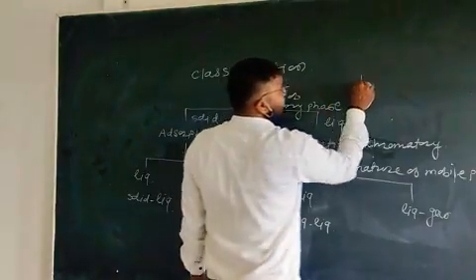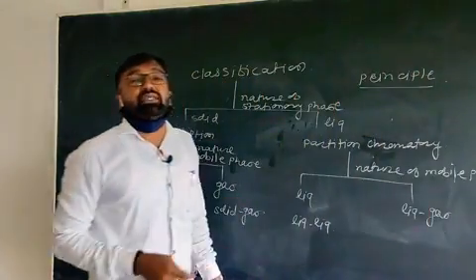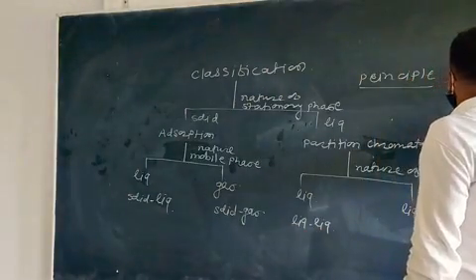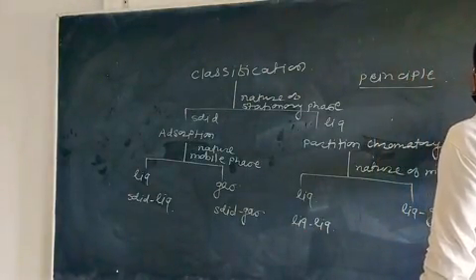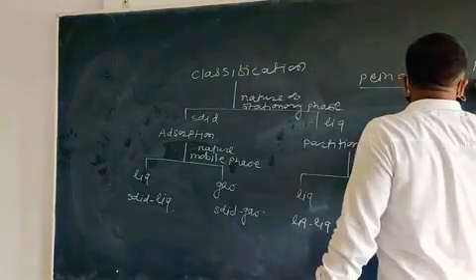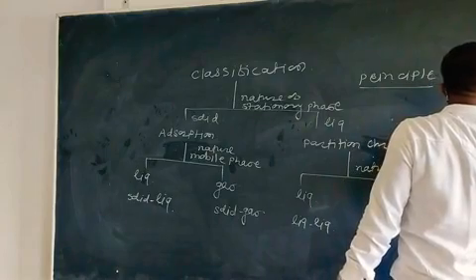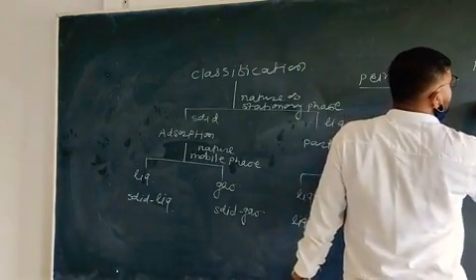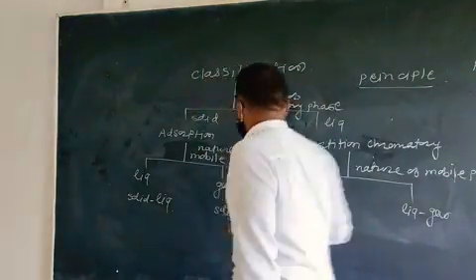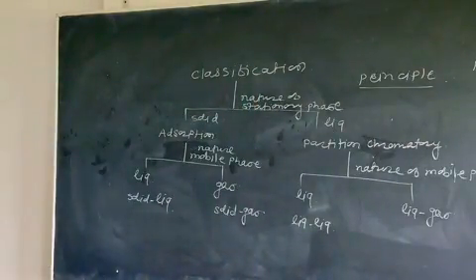If you think about the principle, first see the general principle. In the general principle, separation of the components of a mixture is carried out by various phenomena, that is, adsorption, desorption, partition coefficient, size exclusion, etc. That means various phenomena or physical properties are used during the separation.